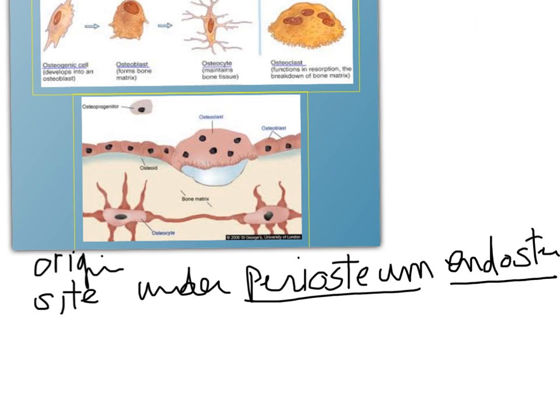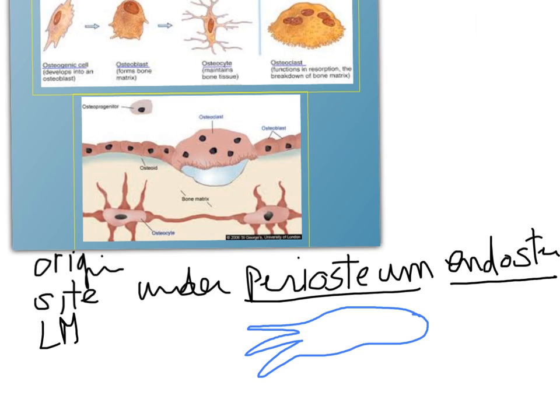Then we have the LM. As regards the LM, it is an oval cell with minute processes. The cytoplasm is darkly basophilic, showing a negative Golgi image, like that we see in the plasma cell.